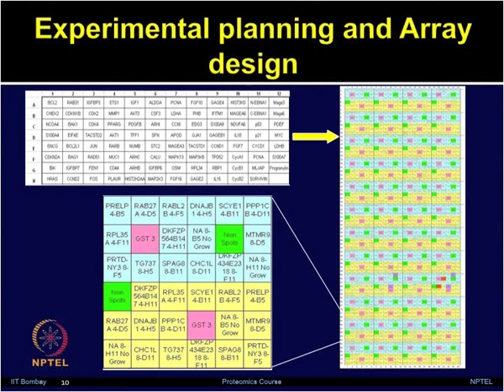So, for example, I have shown you a few insets here. The very top panel in the slide shows different genes which you would like to make on the 96 well plate while doing the DNA prepping. So, first of all you have the clones and now you want to do the DNA prepping. You know in each well, for example, A1, what gene is going to be there, for example, BCL2. Then in H12 you have left it blank.